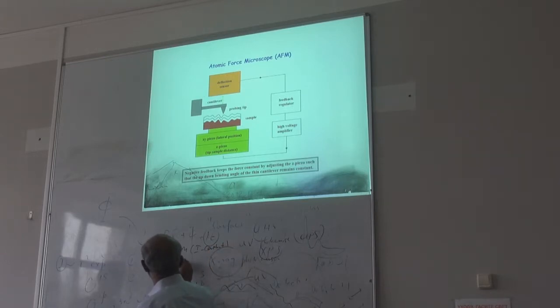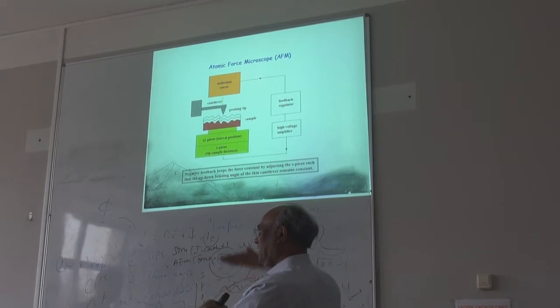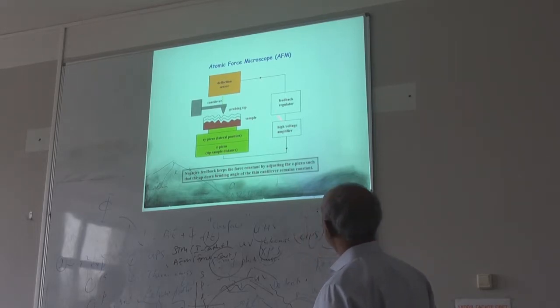In the AFM, you need to keep the force constant. To keep the force constant, it has to move up and down. So using that same piezoelectric device, you can do the mapping. So this is the important thing, this feedback regulator.